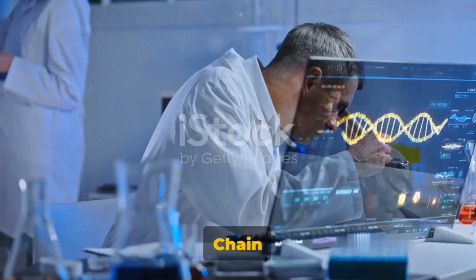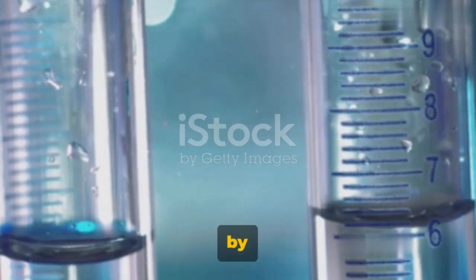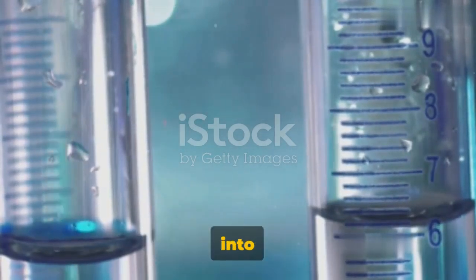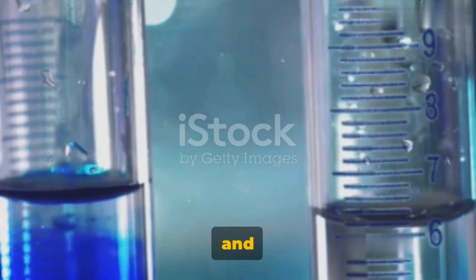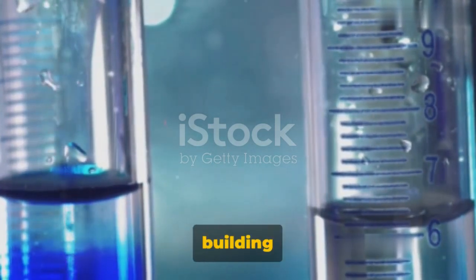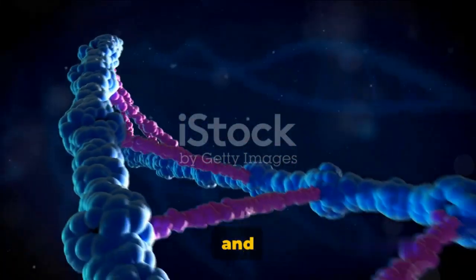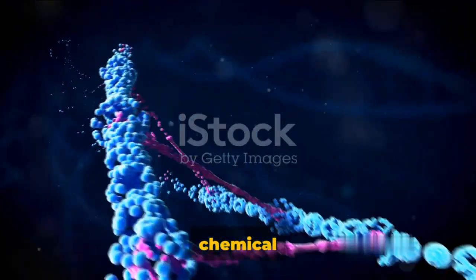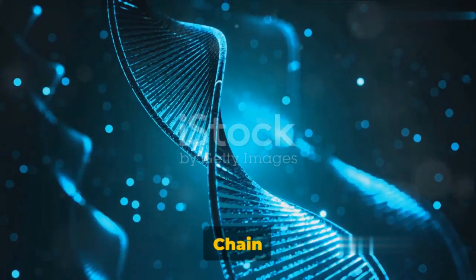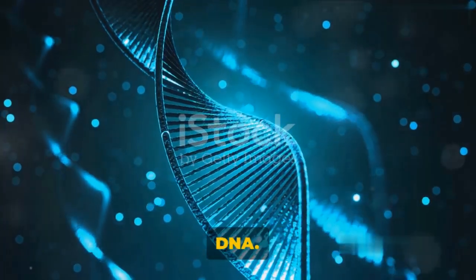On the other hand, the chain termination method interrupts the elongation of DNA sequences by incorporating dideoxynucleotides into the sequences. This method, named after its inventor, is a testament to human ingenuity and our ability to manipulate the very building blocks of life. Each of these methods has its unique strengths and applications. The chemical method offers a deep dive into the chemical properties of DNA, while the chain termination method provides a fast, simple way to sequence DNA.